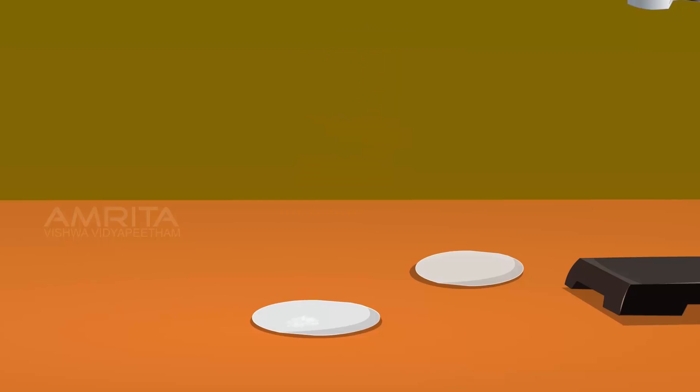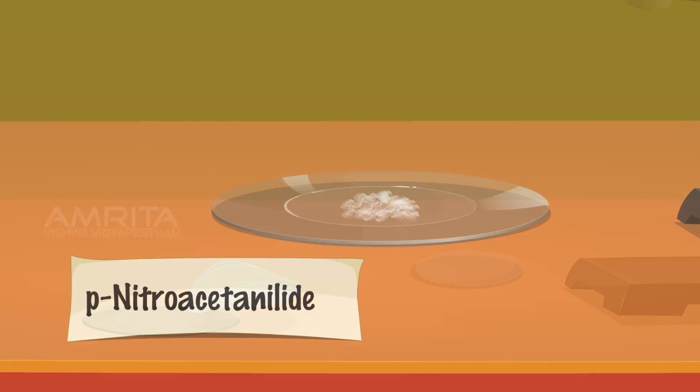Transfer the dried crystals into a watch glass and label the crystals as para-nitroacetanilide.